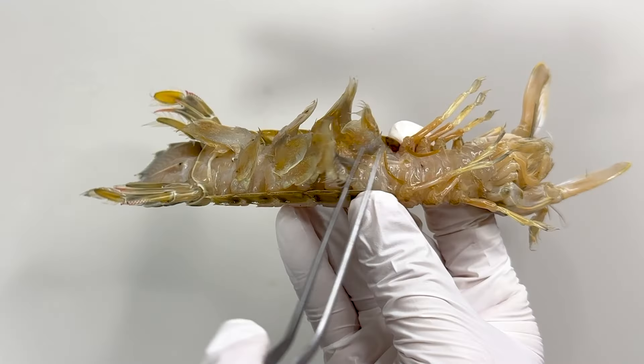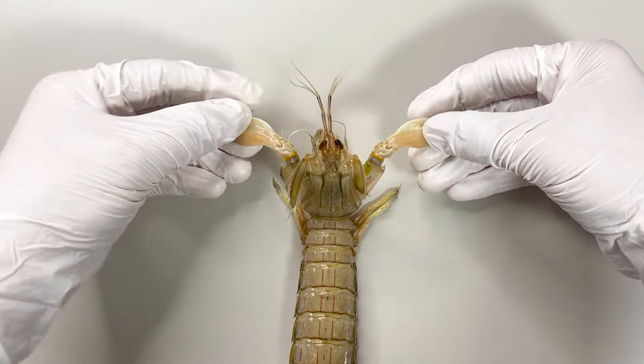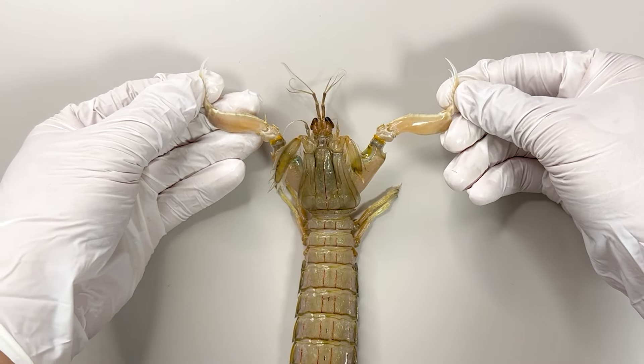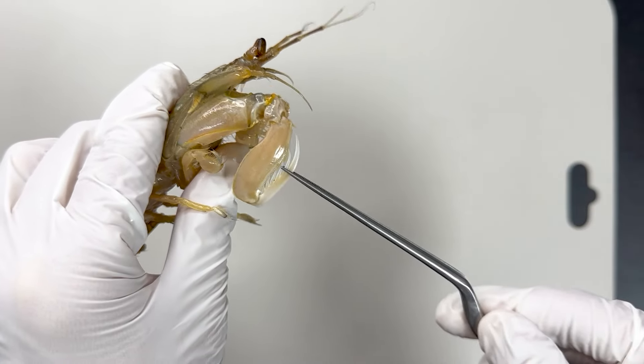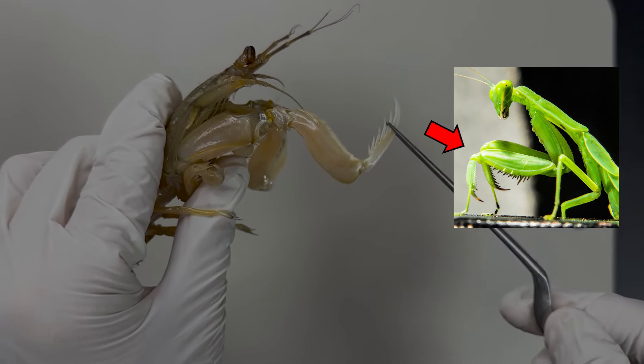Looking at the underside, you'll notice a plethora of legs. Among insects, the mantis shrimp shares the most similarities with the praying mantis. If you extend these limbs, or the raptorial legs, you'll see they closely resemble the front legs of a praying mantis.